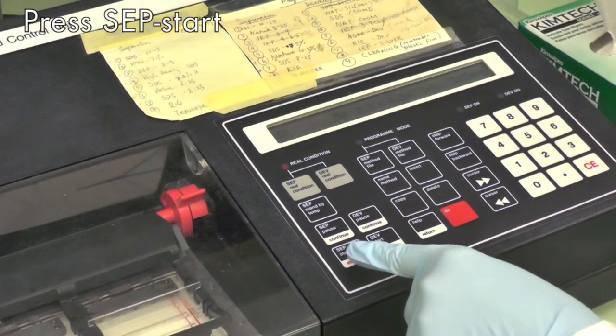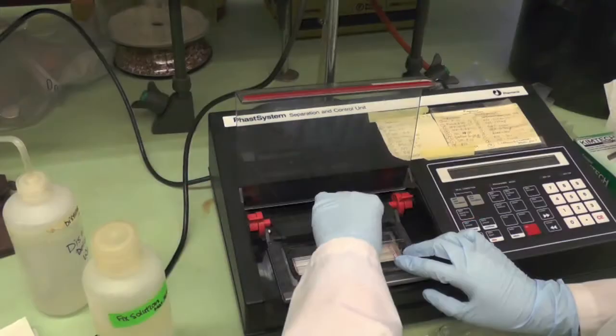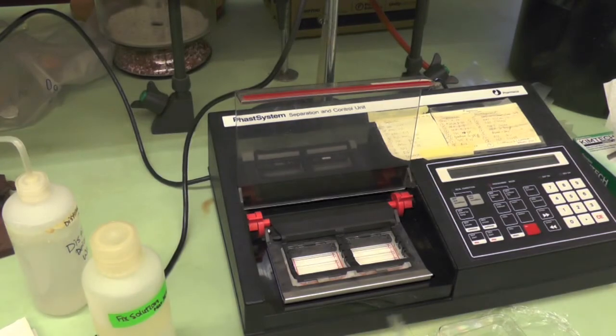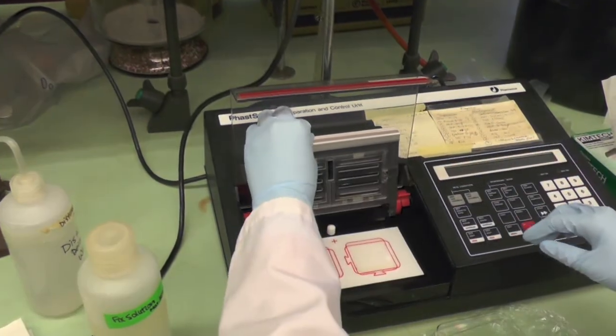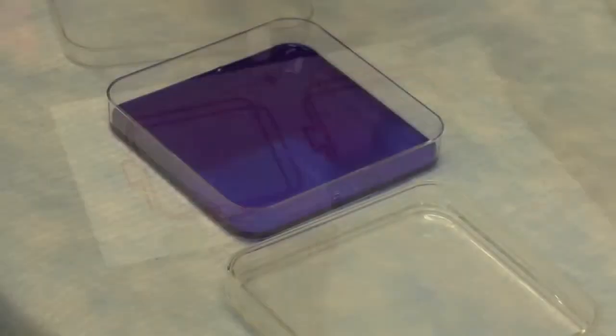Stop the gel by pressing SEP start. Throw away the sample applicator. Take the gel out and immediately put it into the staining solution to stain.